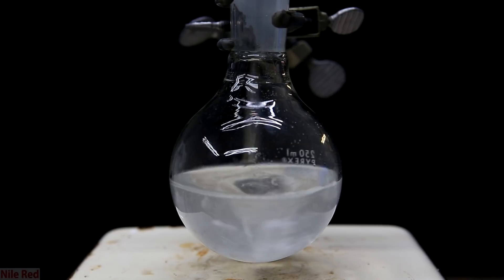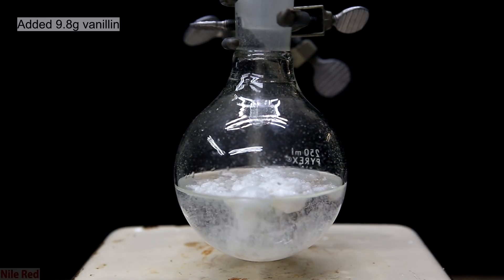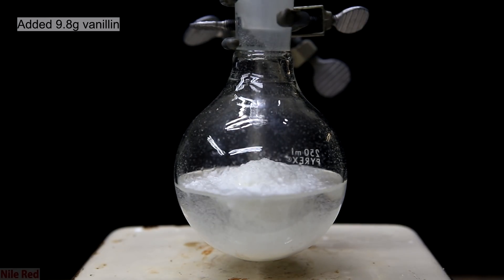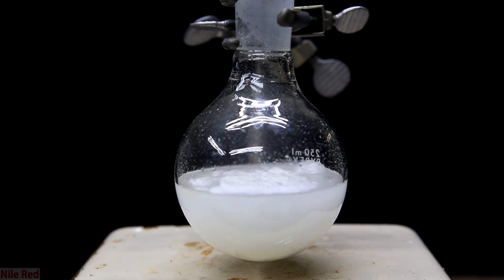The water will slowly clear up as everything dissolves and eventually we'll be left with a crystal clear solution. To this solution we dump in the 9.8 grams of vanillin. I start to stir the solution but it's going to become opaque because vanillin isn't very soluble in water.